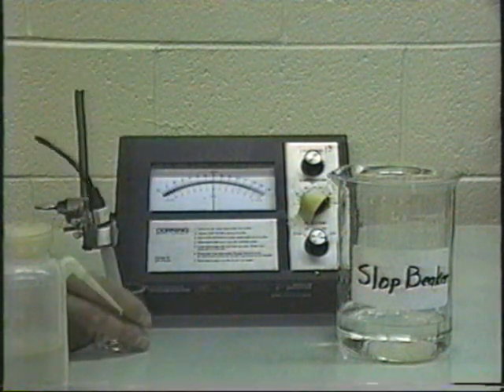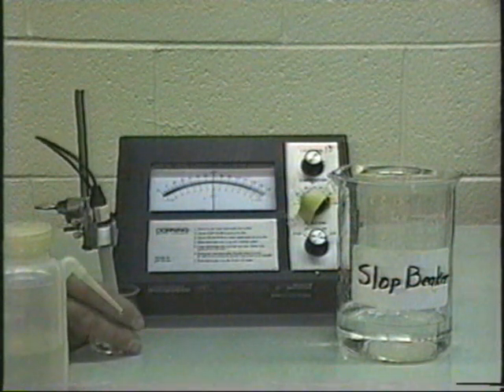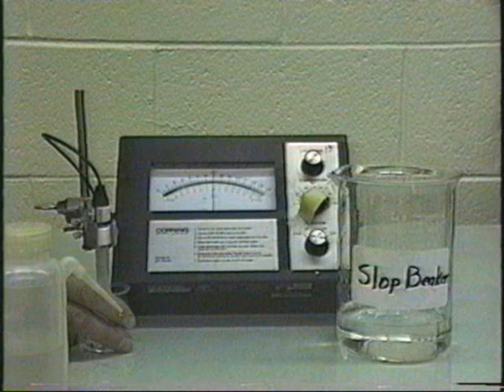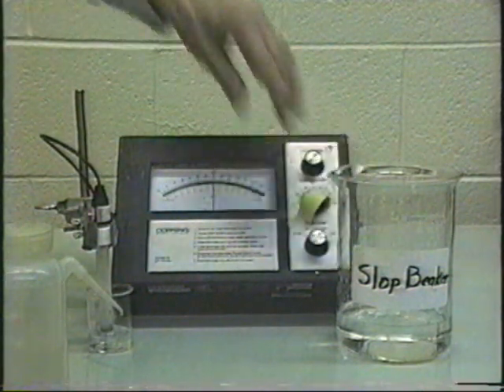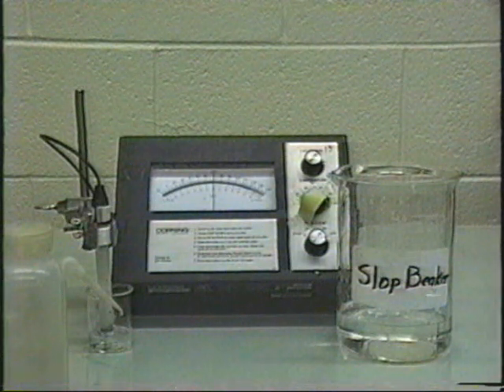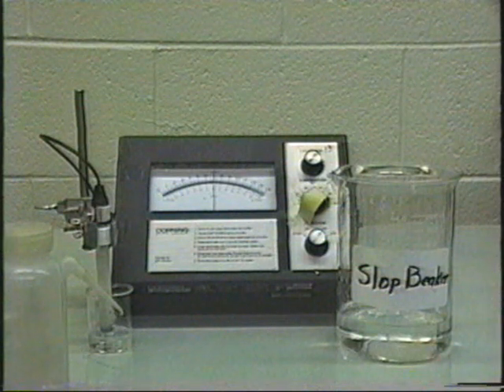Bring your solution into the electrode. The electrodes must be covered, at least those tips that you saw there. Swirl it around, bring it to pH, and then you can do your reading. This is water, which is reading a little bit different than exactly 7. We'll take a close-up on that in just a second here.